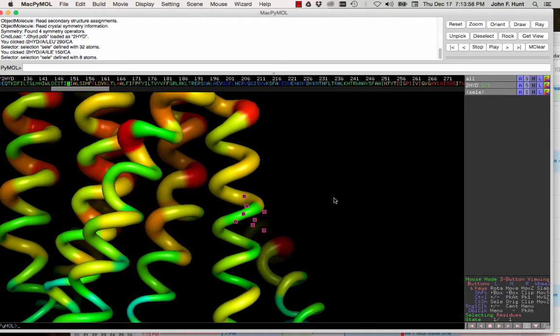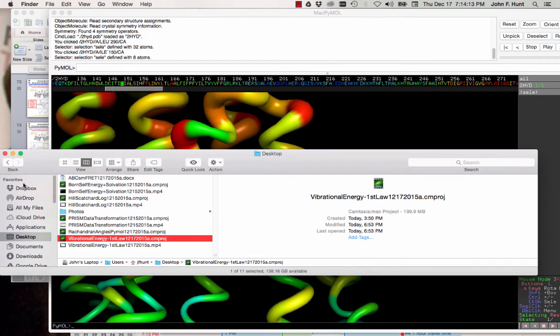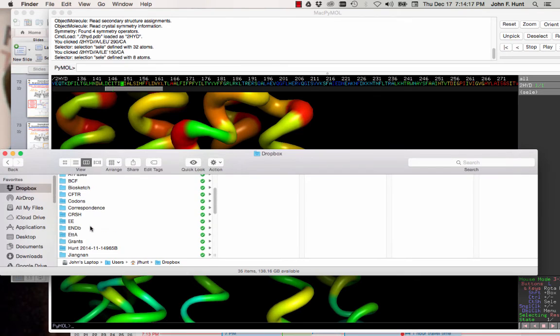We can double check all of this by running the script that calculates the exact Ramachandran angles, and we'll see if that agrees with our conclusion here. I will first have to dig up the script. Give me 1 second.